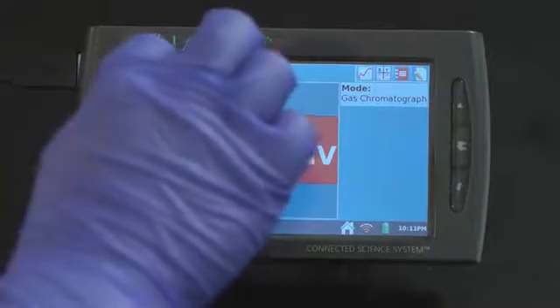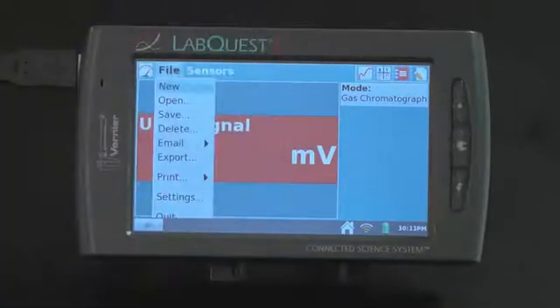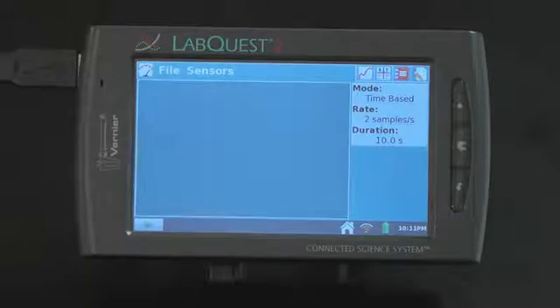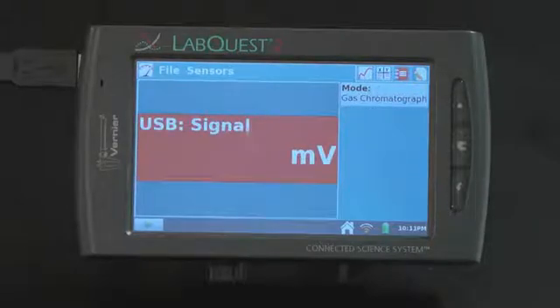Select File, New to ensure software settings are set to default values. Tap on Collect to bring up the temperature pressure profile.